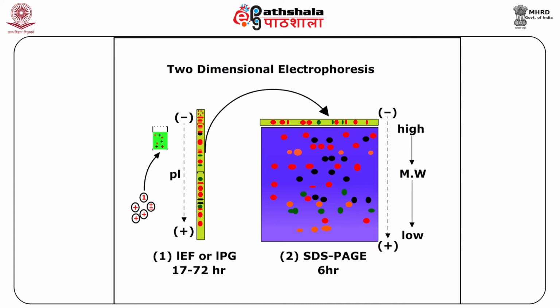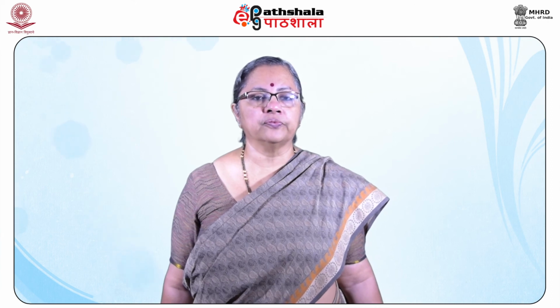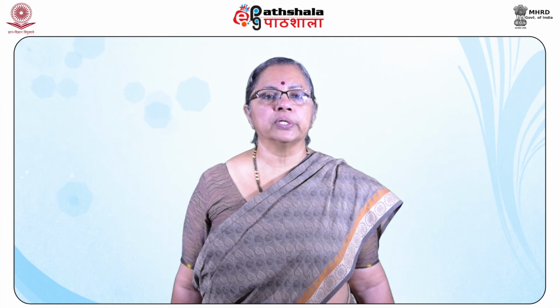In the second step, the capillary gel is placed over a second SDS-PAGE slab gel, and the polypeptides move in the second dimension based on their molecular weight. It is possible using robotic arms to pick up each protein spot after two-dimensional electrophoresis and submit them to mass spectrometry.